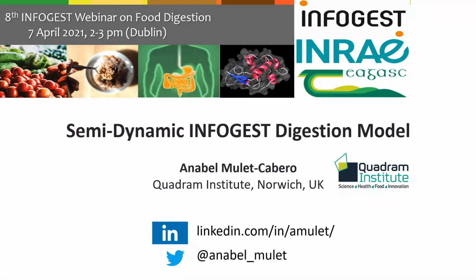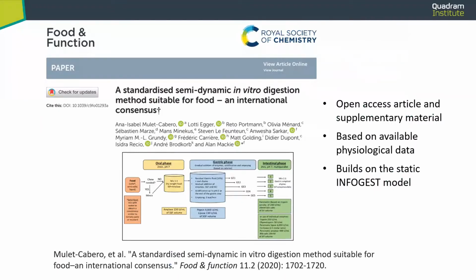Hello everyone, my name is Anabel Mulet-Cabero, and I'm going to talk about the semi-dynamic InfoGest digestion model. This model was published last year in Food and Function. It is based on physiological data, and it builds on the static InfoGest model.